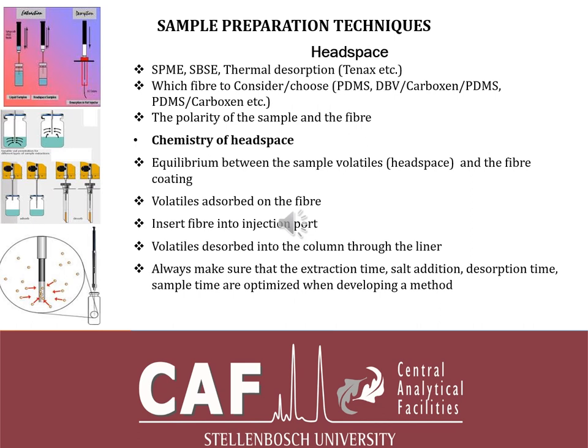And then they started to see peaks, and they said, okay, right, now maybe we can coat the stir bar with different phases, for instance, to see if they can change the polarity of that stir bar to attract the compounds of interest.